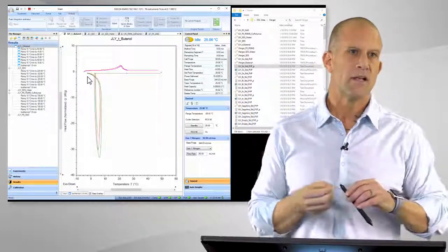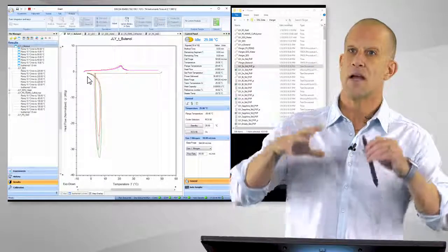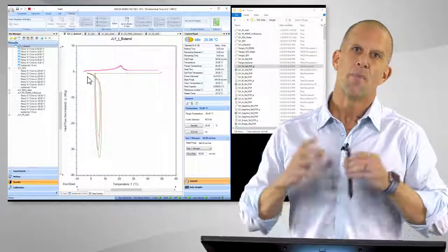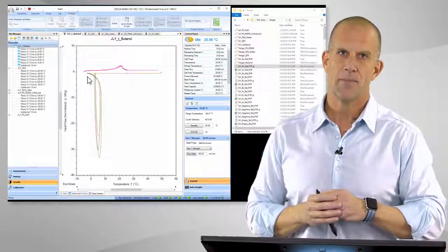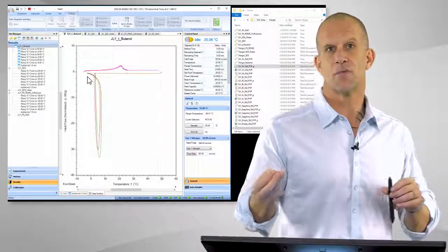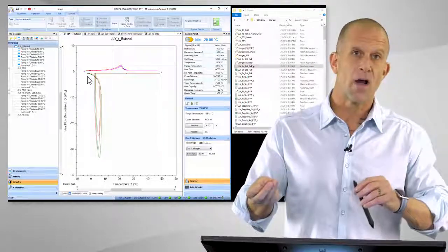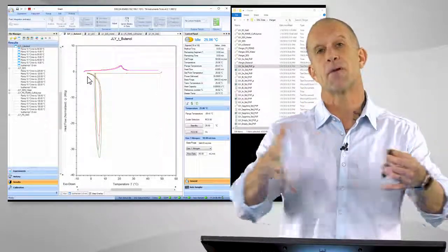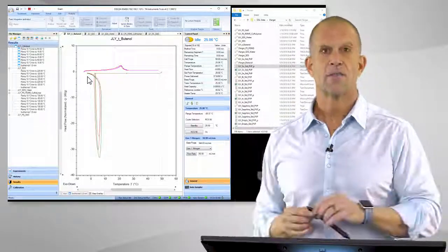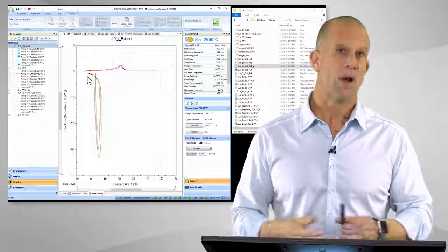We're going to be using this in several capacities at ASU, both online, remote access, etc. And so I'll be providing more documentation on this for students and researchers on how to send samples to ASU to have them run, and or send samples that get put on the autosampler that you can run remotely yourself, along with some future tutorials on exactly how to set up specific types of samples, run them, etc.